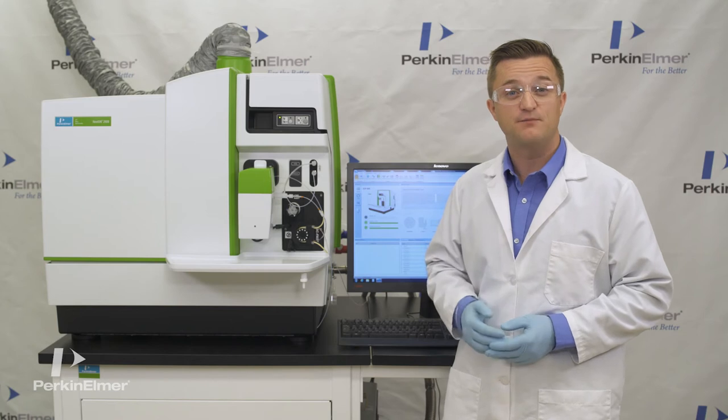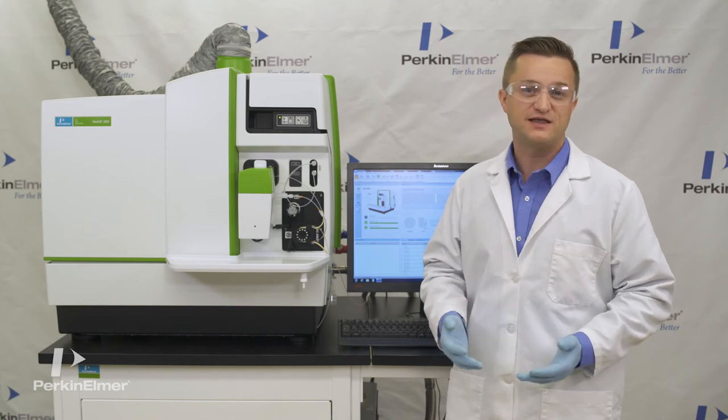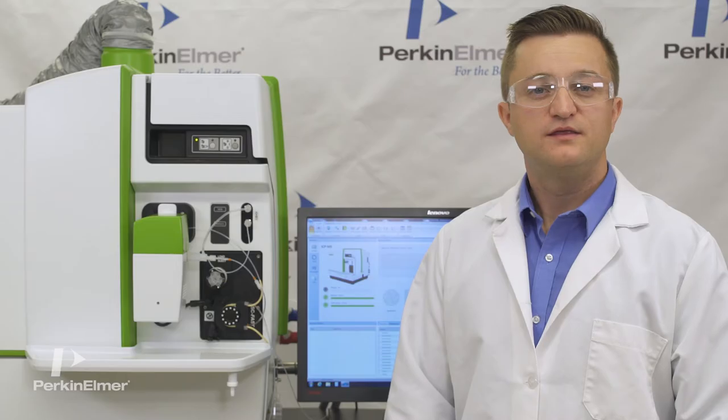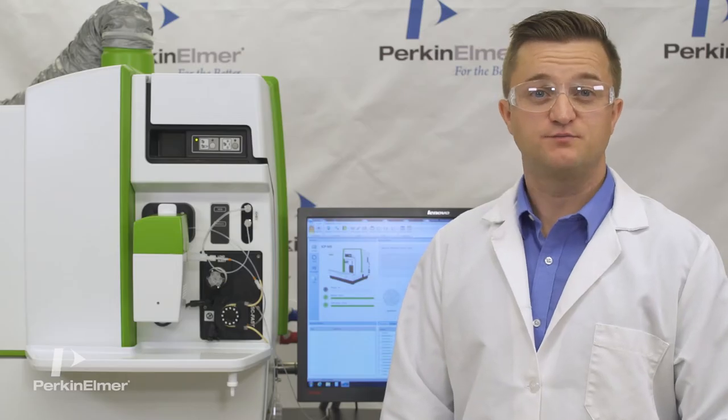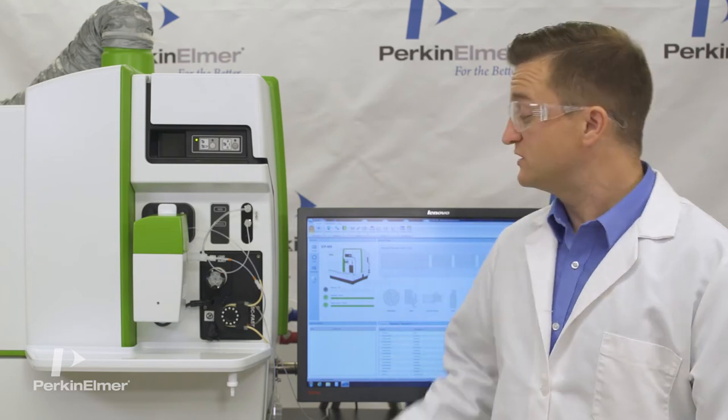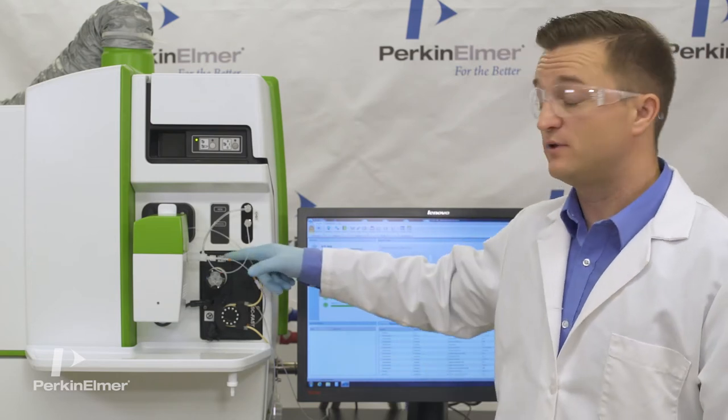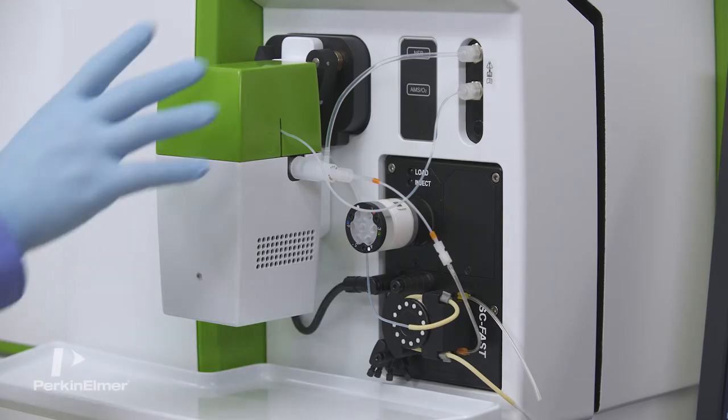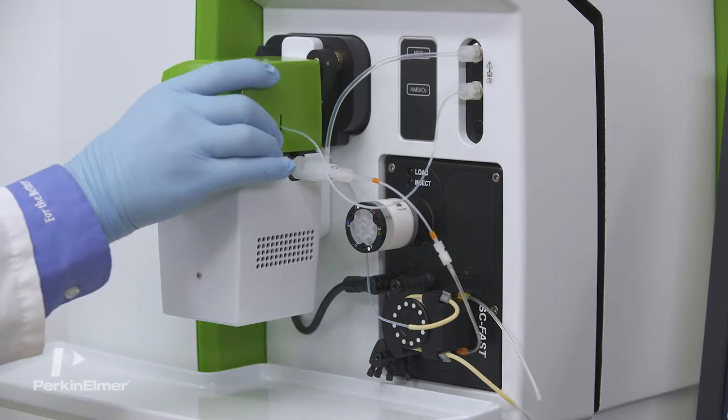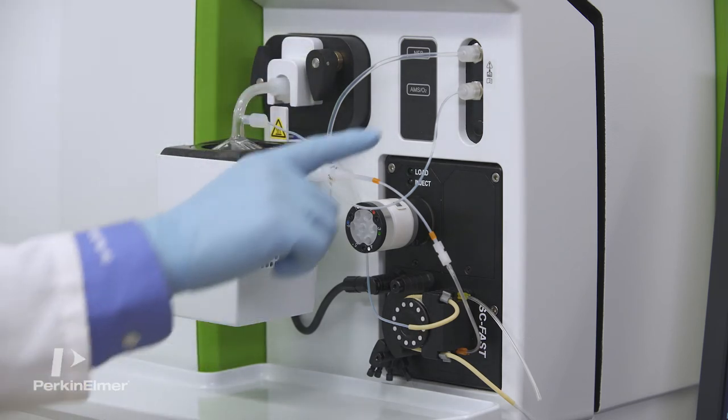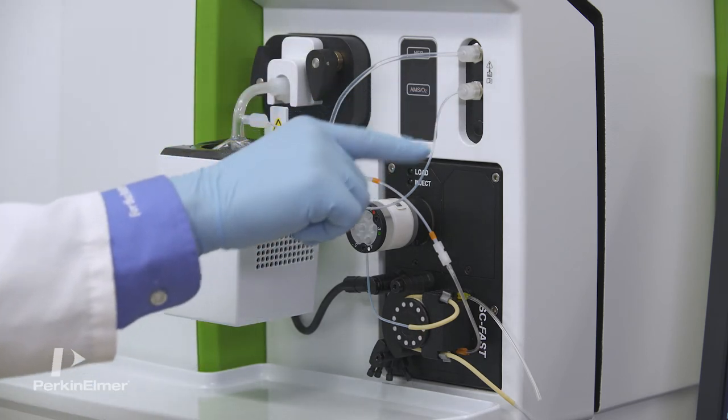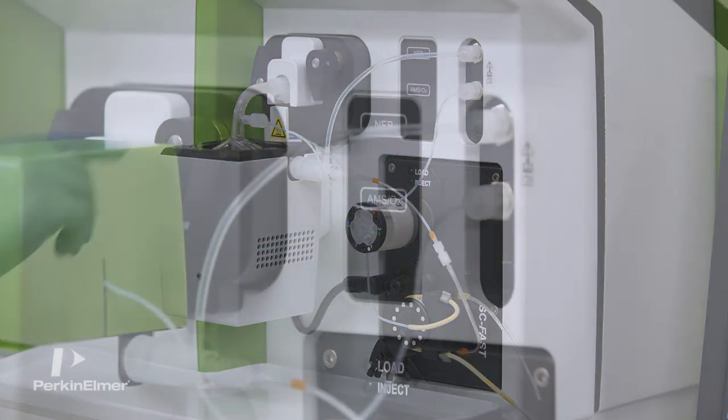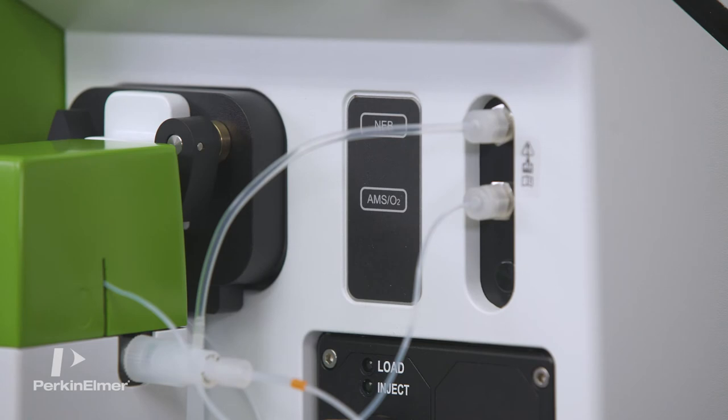It's designed for the busy lab where speed of analysis is extremely important. The Nexion 2000 productivity model features a fast sample delivery valve, a Peltier cooled spray chamber, a demountable torch and injector, and the all matrix solution or AMS.